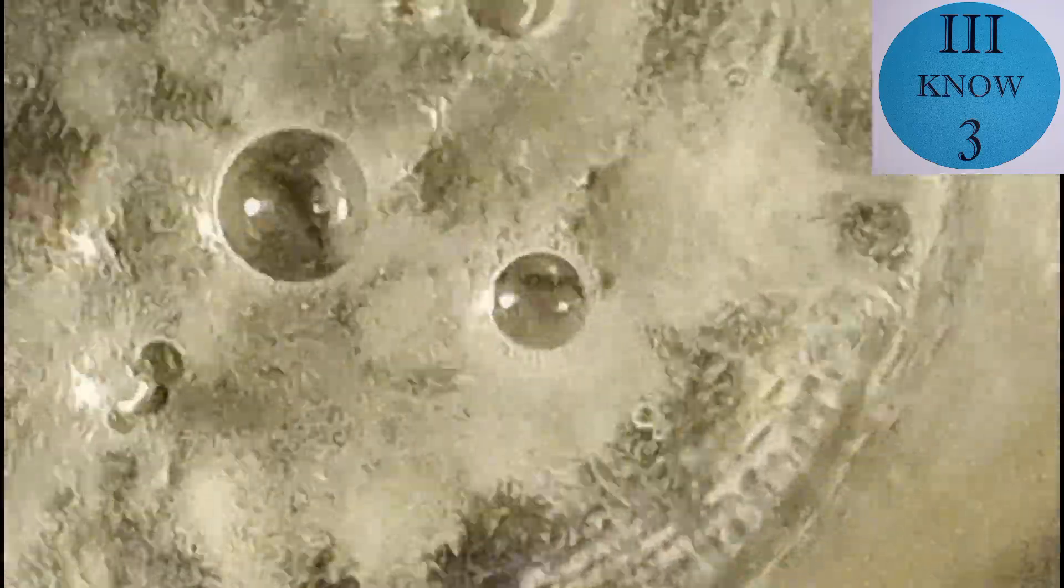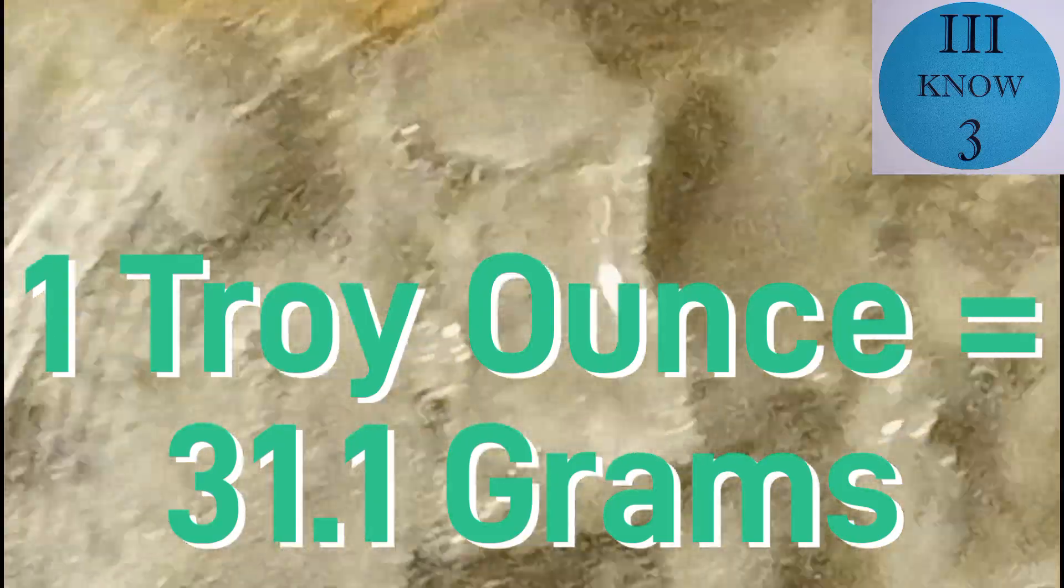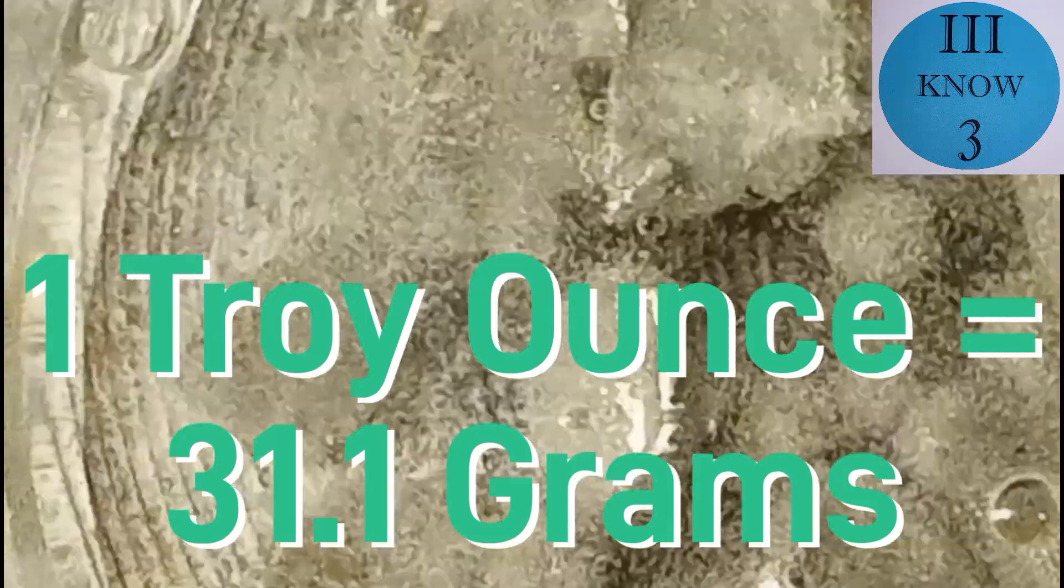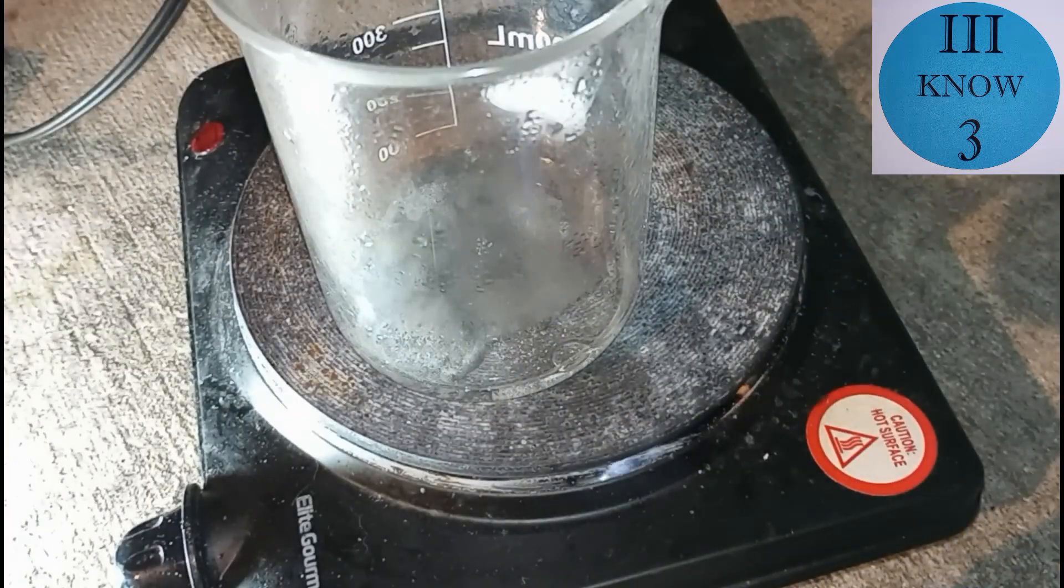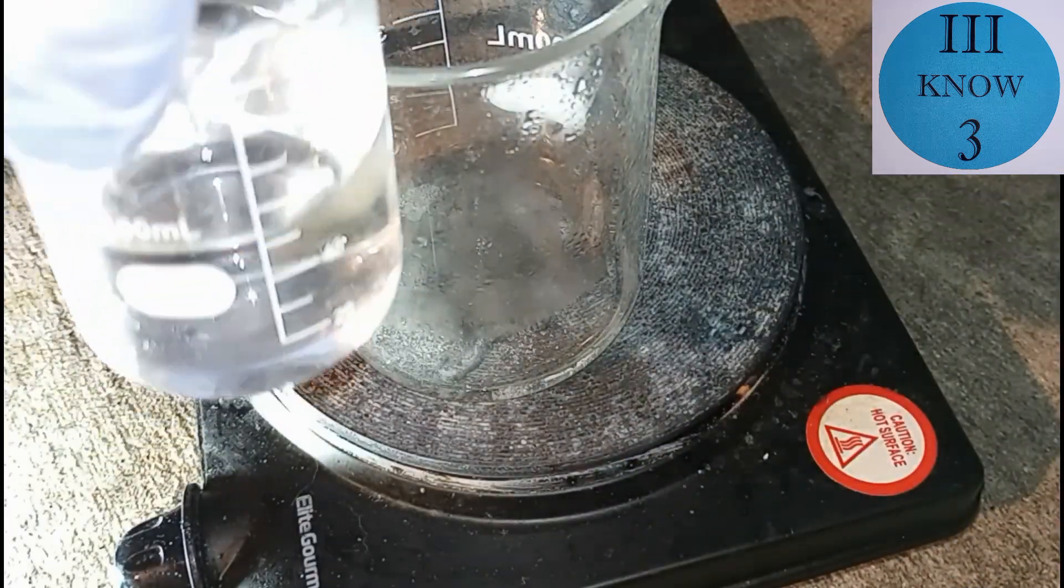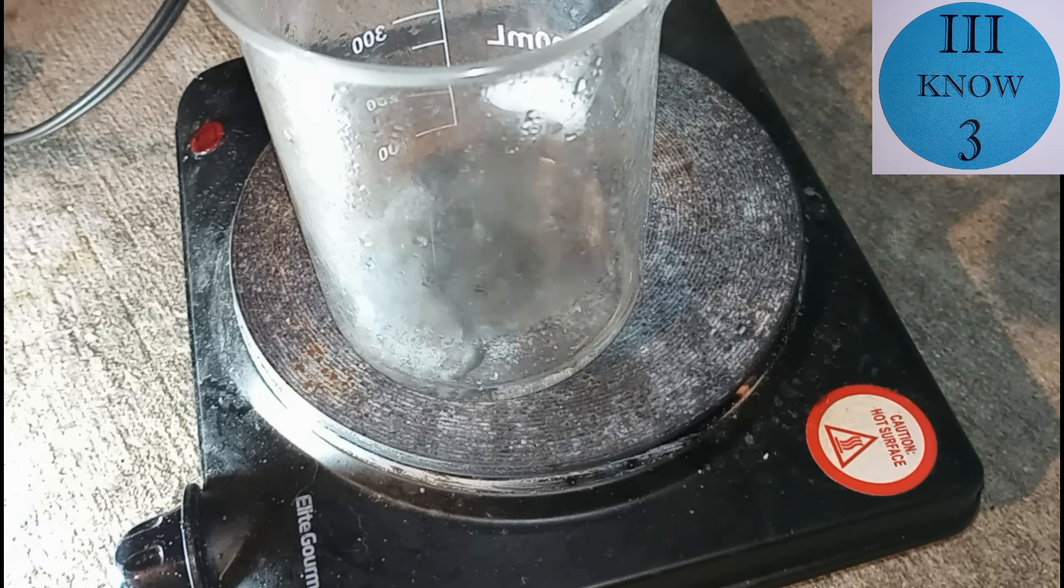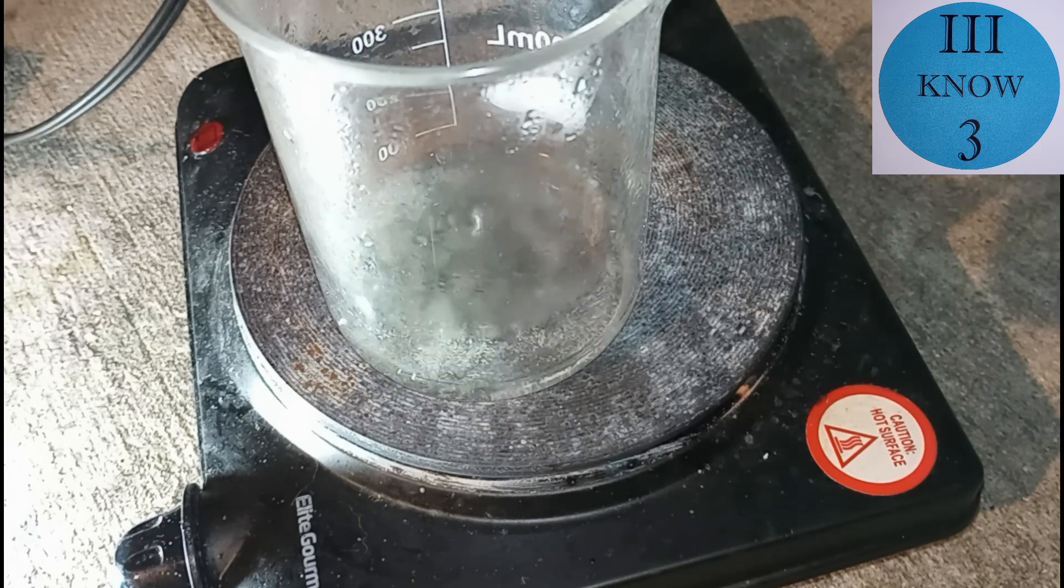I don't think I mentioned it before but this shot was weighed out to just over 1 troy ounce. And at this point I decided I would try hydrogen peroxide to see if it would speed up the process and help the tin dissolve.